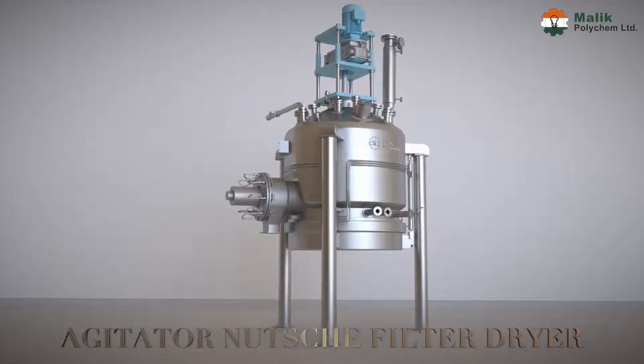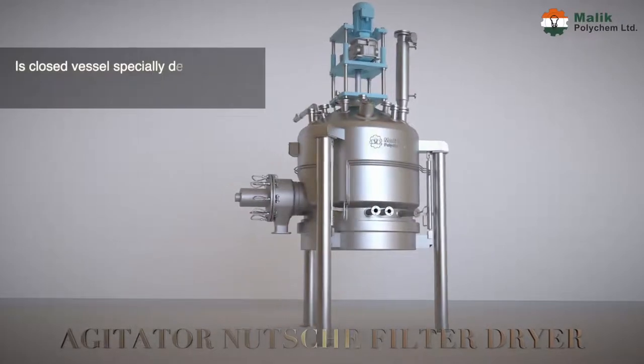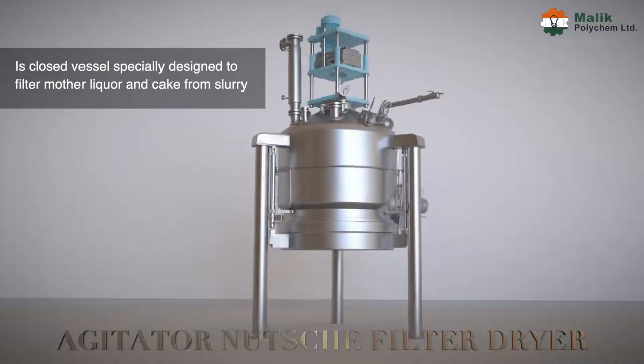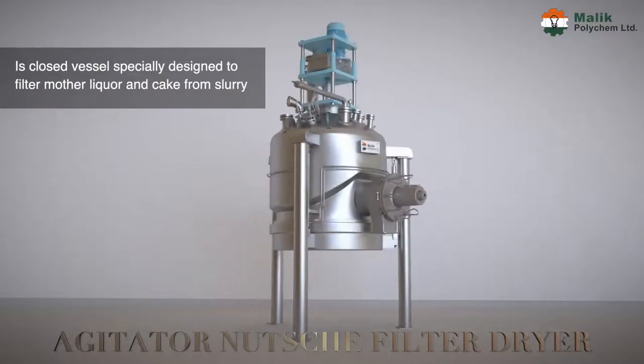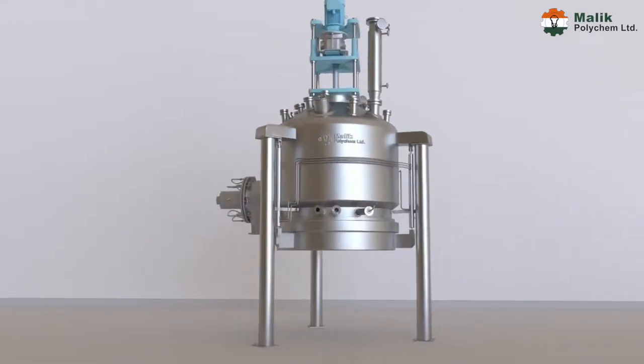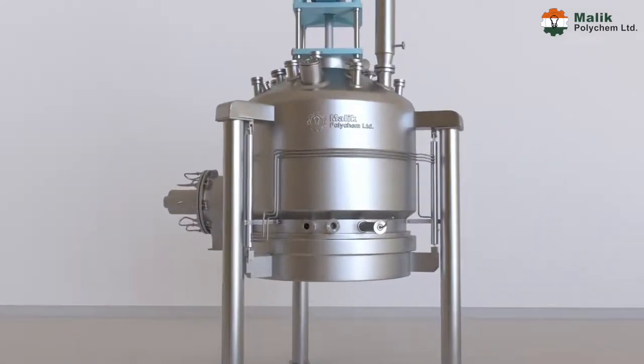Agitator Nutsche Filter Dryer is a closed vessel specially designed to filter mother liquor and cake from slurry, and then dry it by filtration under pressure or vacuum. This can be done in stages.